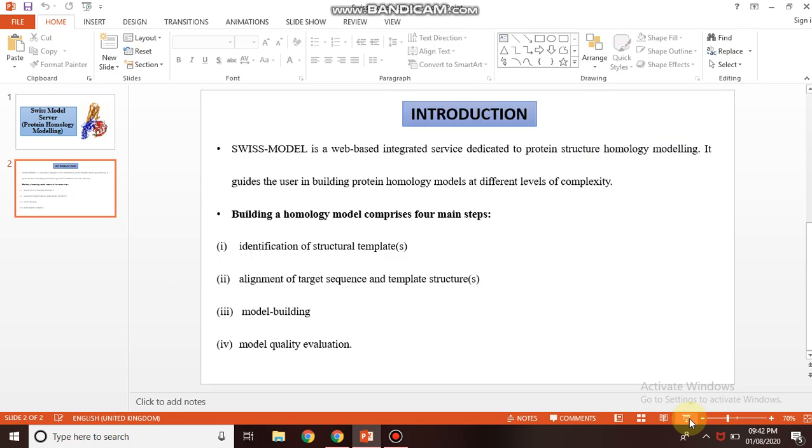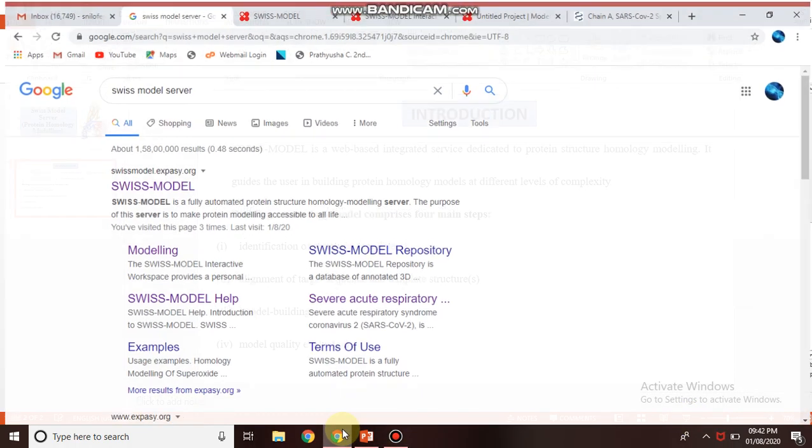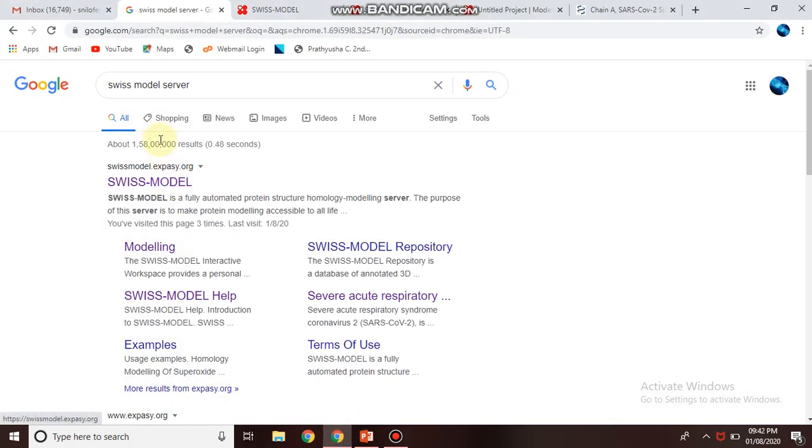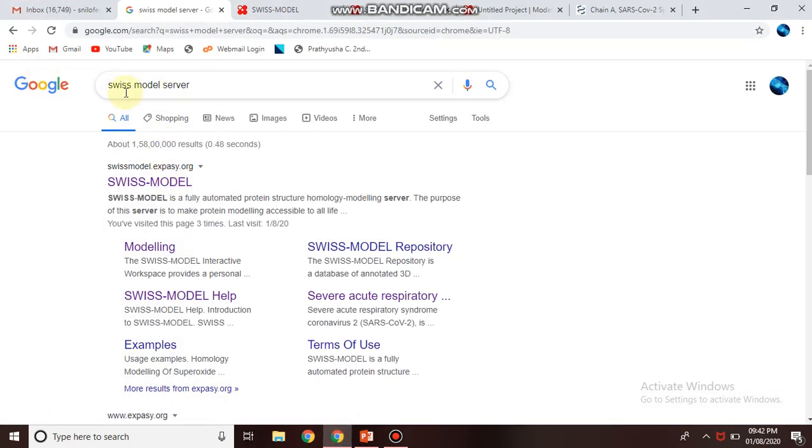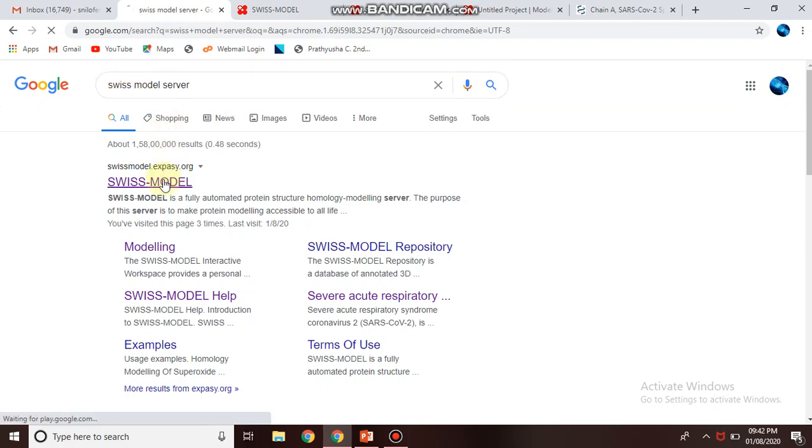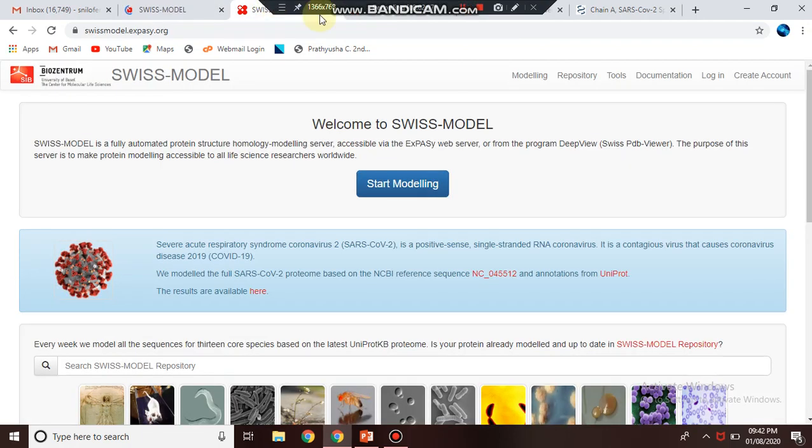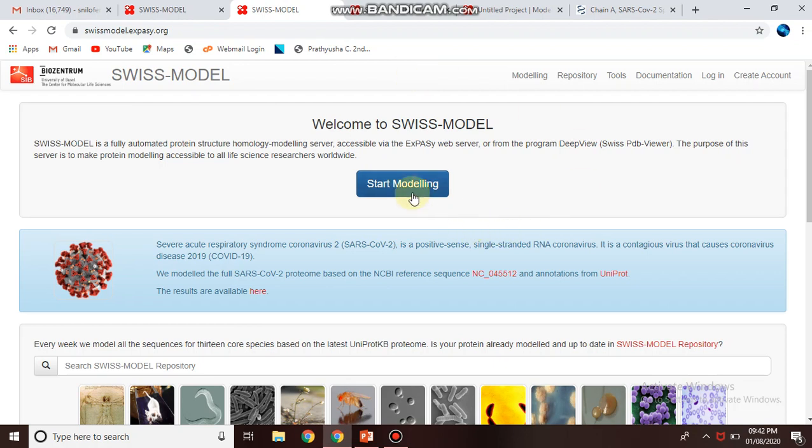I will show you how this works. In Google search, just type Swiss Model Server and the first link will take you to the homepage. Here you have to click Start Modeling.